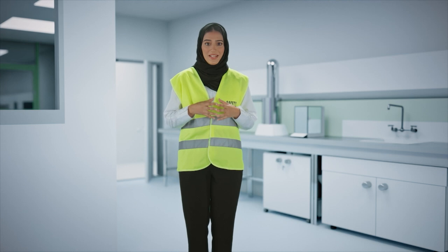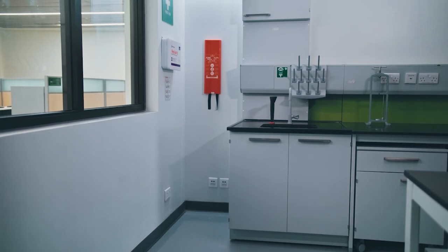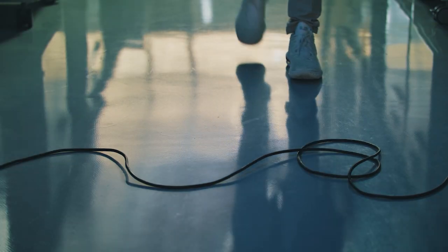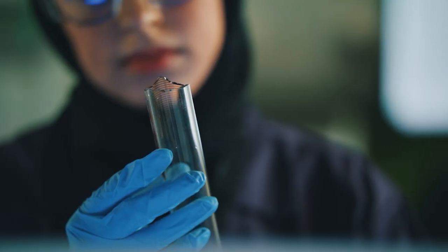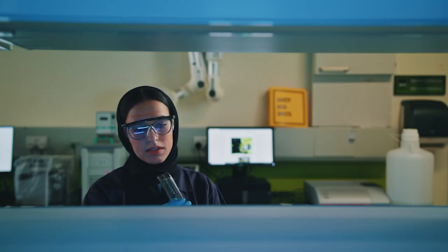In the laboratory and elsewhere, keeping things clean and neat leads to a safer environment. Keep walkways and access to safety equipment free of obstructions. Avoid slipping hazards by keeping the floor clear of trailing cables or spilled liquids. Inspect any glassware for cracks or broken edges before use.